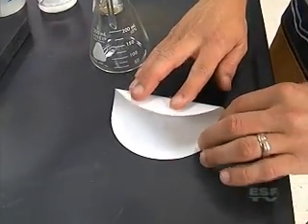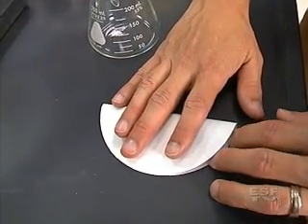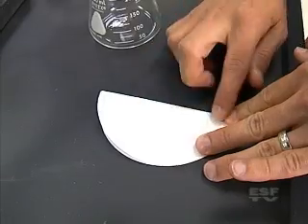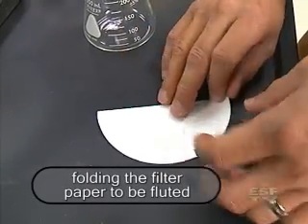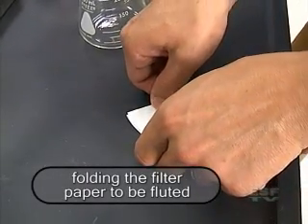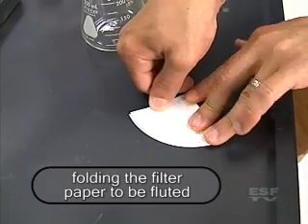So to fold the filter paper I'm going to first fold it in half into a semicircle and form a crease, and then turn it and fold it one more time into quarters. So now I have a cone.